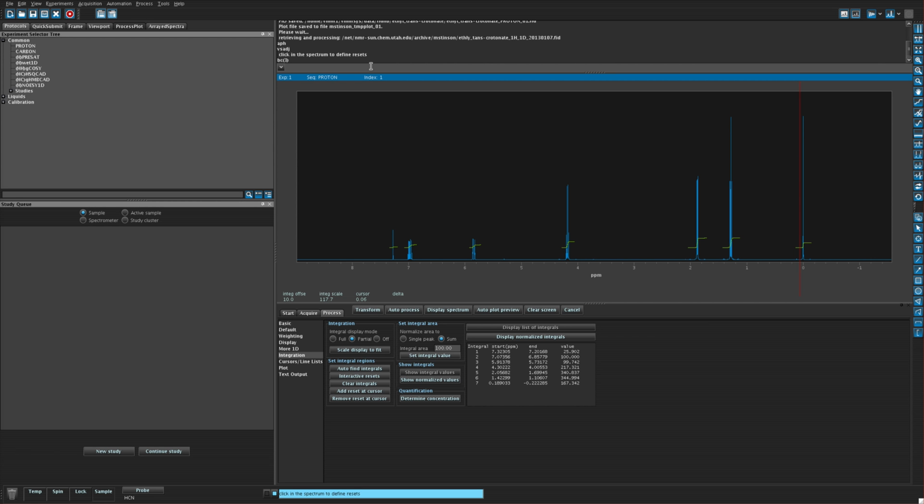For most cases, an argument of 3 or 4 will be sufficient, but if you have a very distorted baseline, you may need a higher order polynomial. It is important to keep in mind that smaller values like 3 or 4 generally produce very acceptable results.